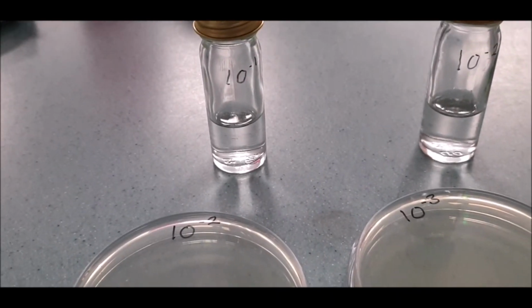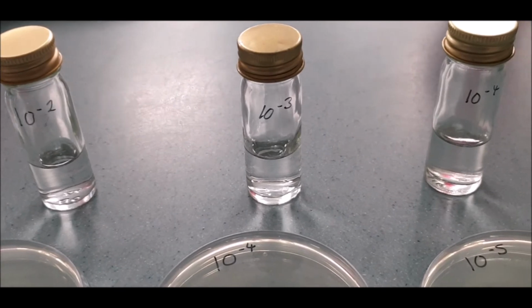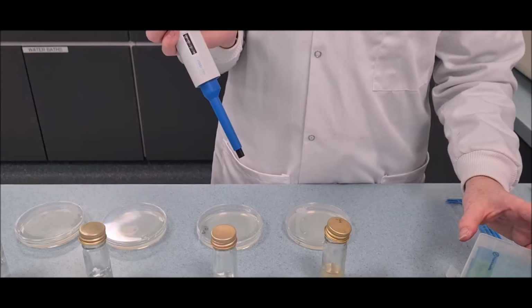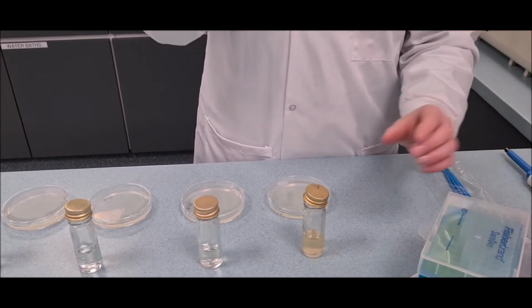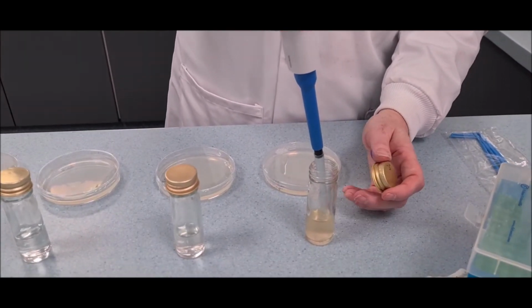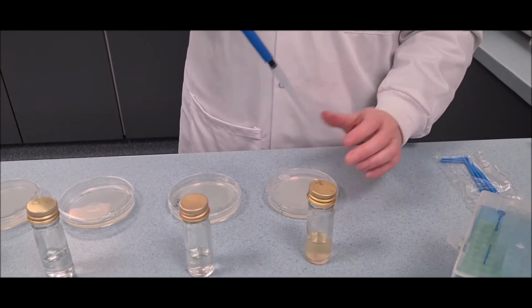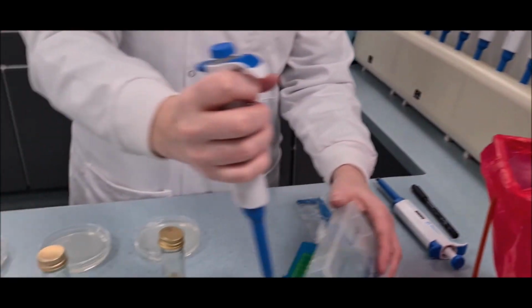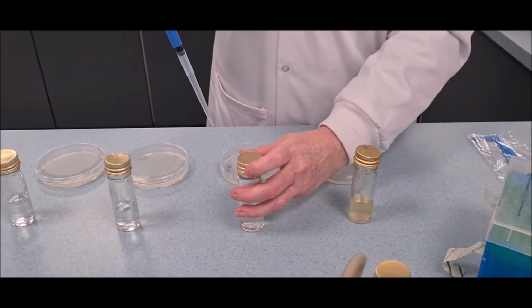As we have seen previously, there are two options of plating the diluted samples. The first option is to plate starting from the least diluted sample. In this case the least diluted sample is 10^-1. This is the sample in the stomacher bag, which is also our first dilution. In this demonstration, we will however, plate starting from the second dilution, 10^-2.